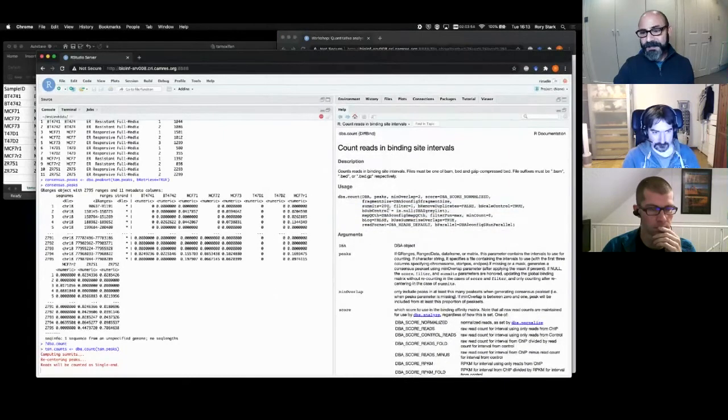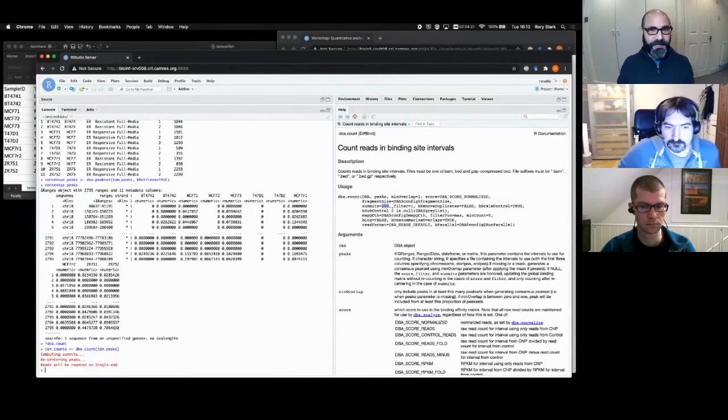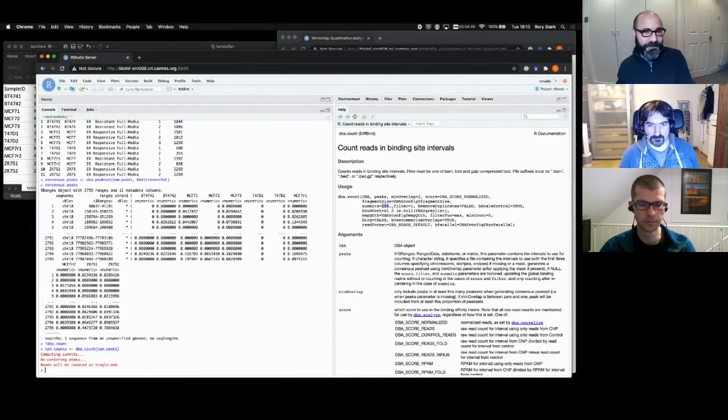If I look here using this value, which is 200. So I take the point of the highest pileup, and in this case, 200 base pairs upstream and 200 base pairs downstream. So all of our peaks are 401 base pairs. So even if they could have gotten very big, we're taking a 401 base pair. Now that number 200, 200 up, 200 down, plus the center is how we get to 401. There's different numbers you might want to use. For ATAC, I usually use 100. Sometimes I've used 50. For wide histone enrichment, I've used 500. So this is kind of optimized for the kind of reads we do for transcription factors.